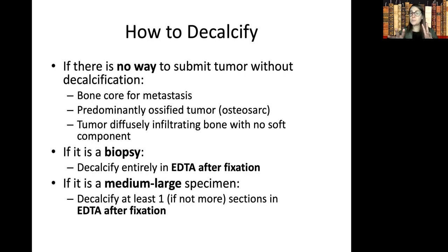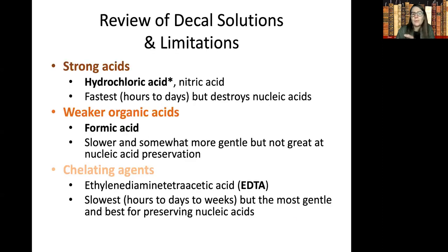If it is a larger specimen, you may want to decalcify at least one or more sections in a gentle decalcifier like EDTA, again, after fixation. And you can do additional in your harsher, regular HCl. Right? Why am I talking about all these different decalcifiers? Aren't they all the same? Definitely not. So, brief review of our decal options.